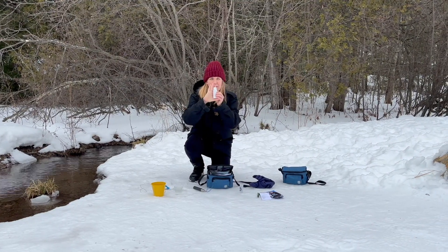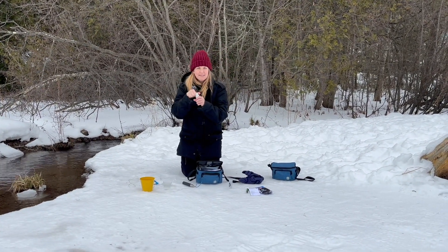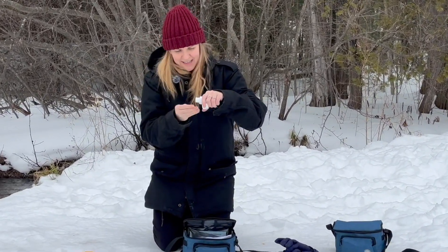Your chloride strips are in this bottle. Keep this out of the sun, so make sure you take your strip out and then close it right away. Go ahead and grab one with dry hands.